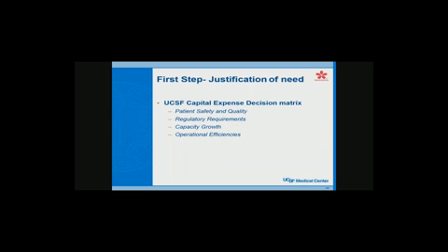So now we're going to get into how you go about implementing this kind of system. And of course, the first thing you have to talk about is money. Do you have the money to do it? Some places build their own systems. Maybe they have some talented people that sit down and just work it out. Small laboratories can often do this on their own. As you get larger and more complicated, you need a commercial system that's going to cost you some money. Plus, all the hardware costs a lot of money.